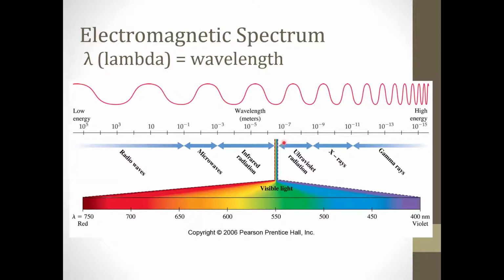So visible light falls within part of the electromagnetic spectrum here. It's a very narrow part of the electromagnetic spectrum, and it ranges from 750 to 400 nanometers in wavelength. Wavelength is the measure from one wave to the next. Down here, low energy red light is at 750 nanometers. That's how far it is between the wavelengths. And way up here, 400 nanometer violet light.